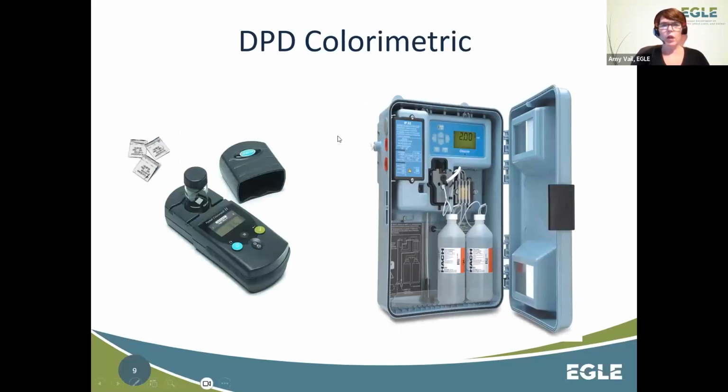So these are kind of the more common ones that you would use in your treatment plants. A lot of them, if you're a surface water treatment plant, have these inline ones that give readings, and they will put them to your SCADA system, so they're pretty hands-off for the most part, for your entry point and things like that. And then when you're out in the distribution system, these handheld ones are typically the ones that get used.